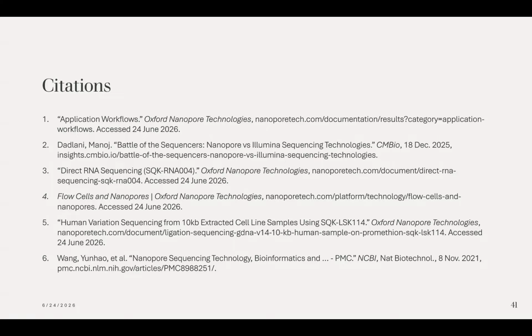Yeah, that makes sense. One other point that I wanted to make about your first question, regarding the barcoding and how many samples you can run per sequencing run. I remembered that the PromethION at least has 2 ports where you can plug in 2 separate flow cells. So even if you're not barcoding, you can run multiple samples at one time, which I generally like to do because you can prep multiple libraries at the same time, you can sequence multiple samples at the same time, and it cuts down the overall time and cost for sure.